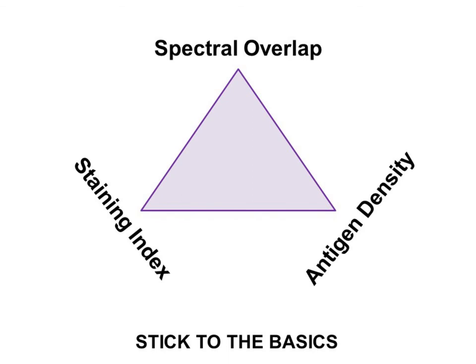So clearly, today's presentation was to show you how we have conceptualized the framework for panel design, the core panel design. We think that we have very good quality in terms of resolution of the main populations of interest, and we have worked out the core panels in a way that most of the problems are solved already, because this is what we took care of.